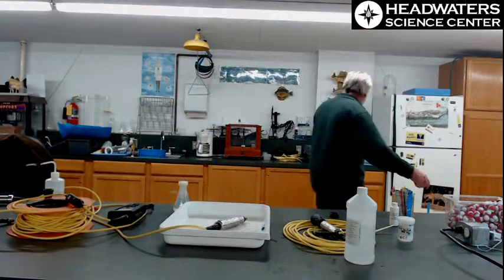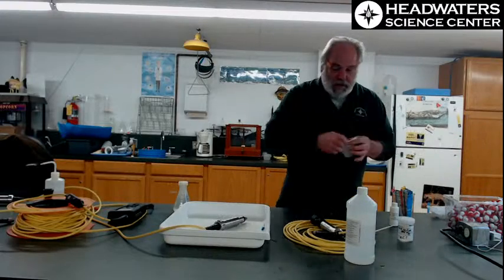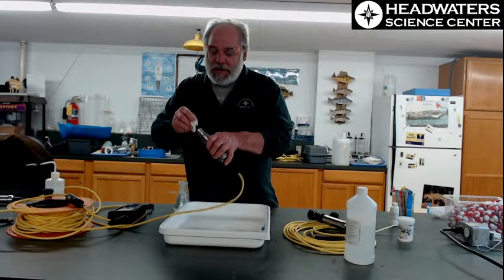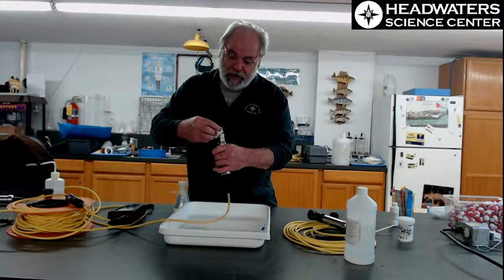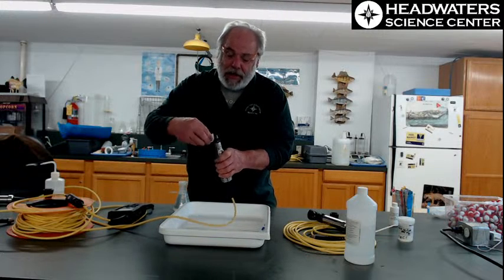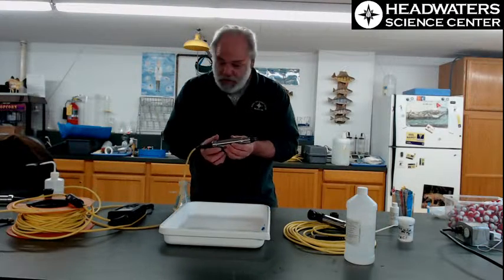I've got to get a chem wipe right here. That's the one thing this meter is a little particular about. These are chem wipes. They'll be in your kit, and we use them at this calibration point. You want to always inspect the meters, but especially this one, because this one has a somewhat fragile probe end here, and we want to make sure there's no marks or dings on there. It looks good.